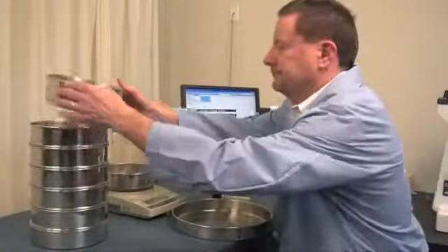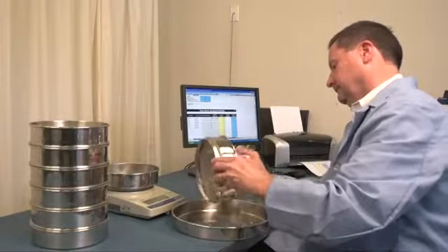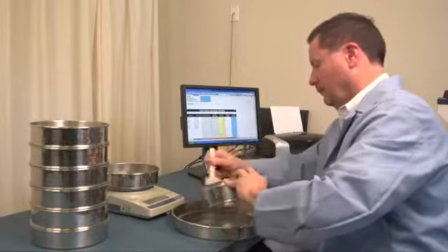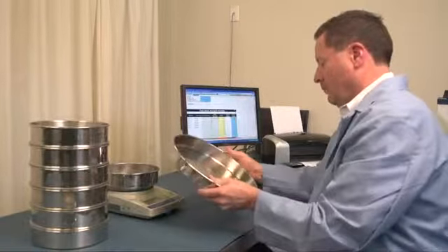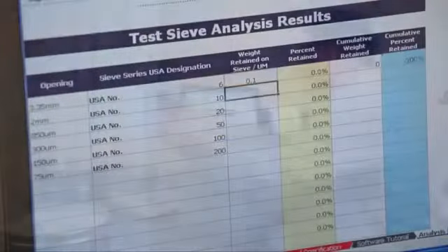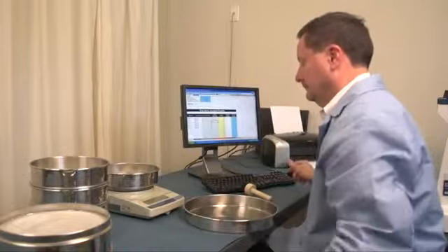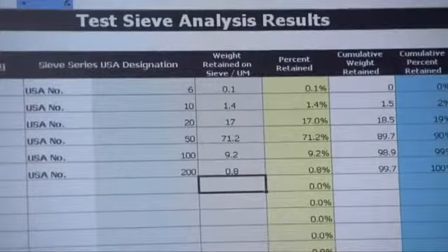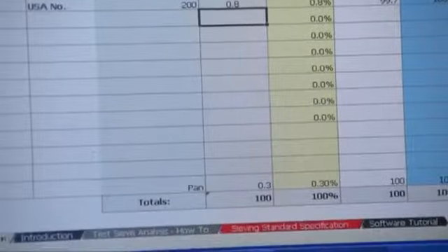Empty the sample material retained on the top sieve into the empty container. While holding the sieve over the container, gently brush the underside and inside of the sieve to remove all remaining particles. Weigh the contents in the pan and record data. Repeat these weighing steps for each sieve and bottom pan, making sure to collect all particles. Verify the new total sample weight against the original mass sample weight. Generally, a difference of less than 1% is acceptable.